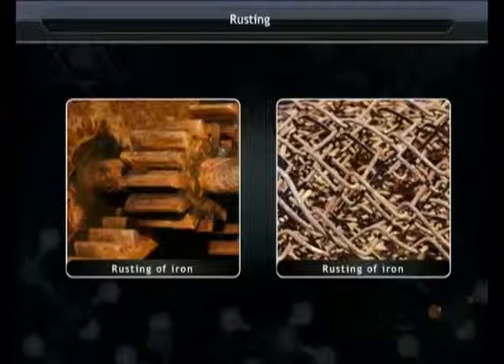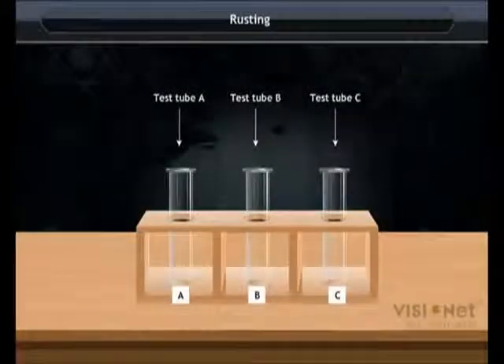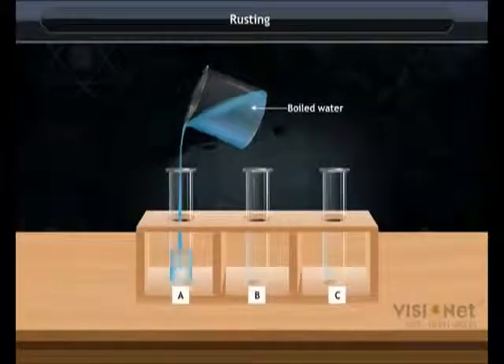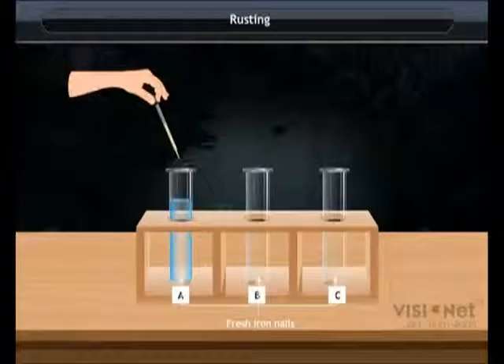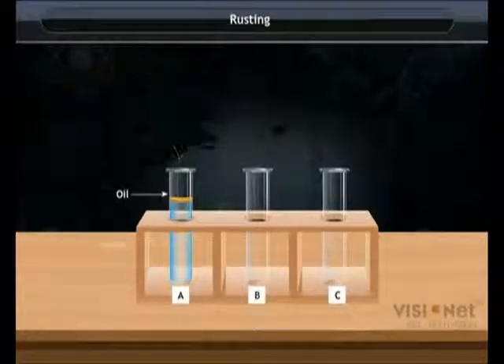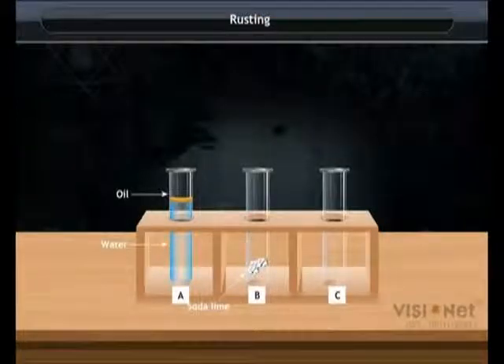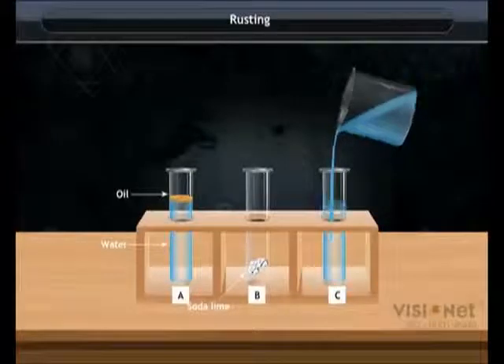Let's explain rusting with the help of an activity. Take three test tubes labelled A, B, and C. Add some boiled water and one to two drops of oil in test tube A. Add a small cloth bag containing soda lime in test tube B, while add ordinary water in test tube C.